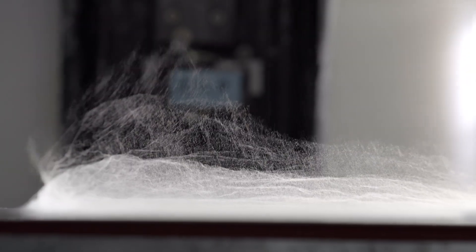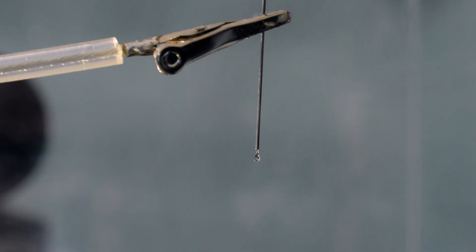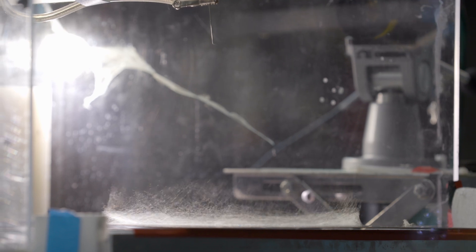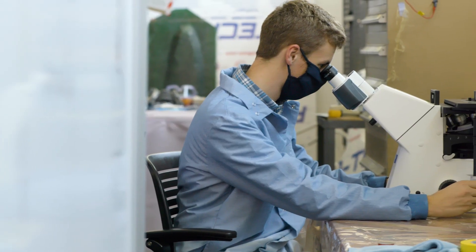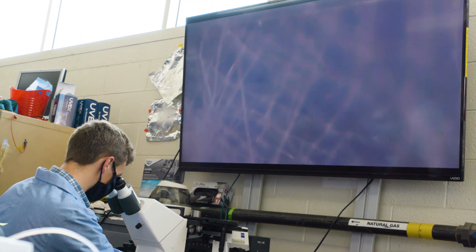The process we use is called electrospinning. We take a liquid polymer which we then push through a tube at high voltage and it stretches this polymer nice and thin into nanofibers. We then spray these nanofibers across a material evenly but in a random manner which creates a nice filter.